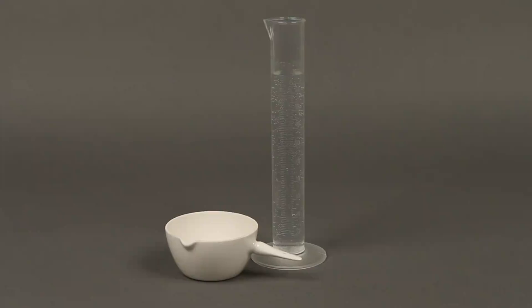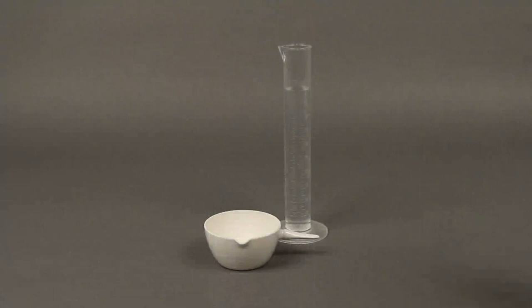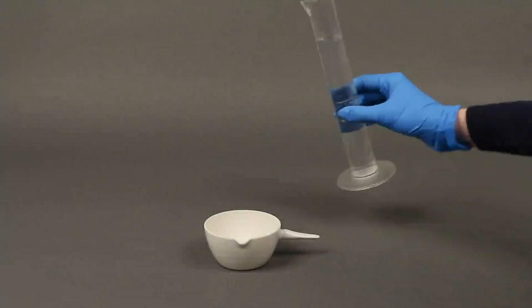First, measure 100 ml of the water to be tested in the graduated cylinder. Then pour the sample into the casserole dish.